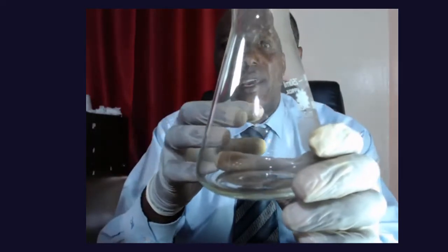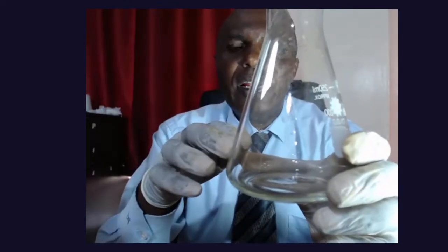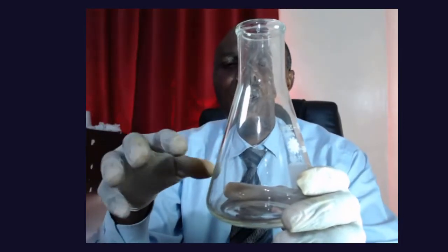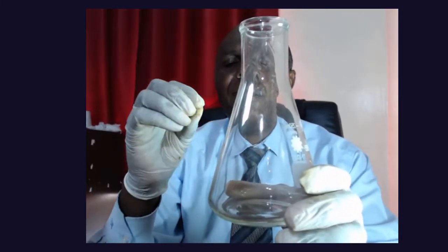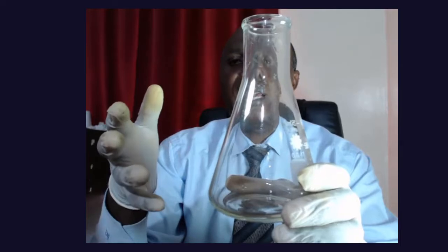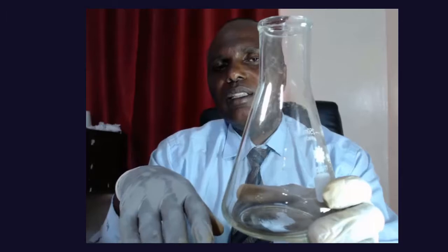The purpose of the indicator here is to check for us when the reaction has come to an end so that we can stop the reaction. In the process that we call titration, when the reaction is over, the indicator changes and we say that the titration has come to an end point, and we stop reacting. Then we take the data and we start our calculations.